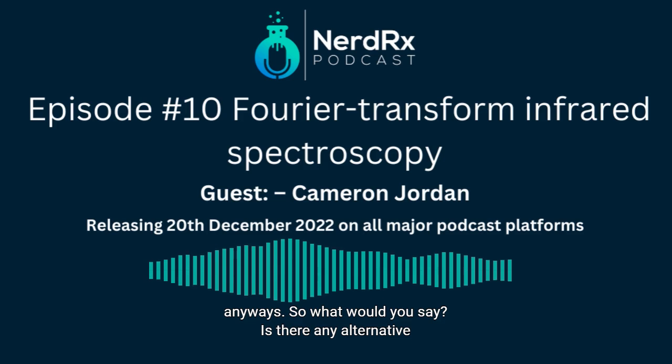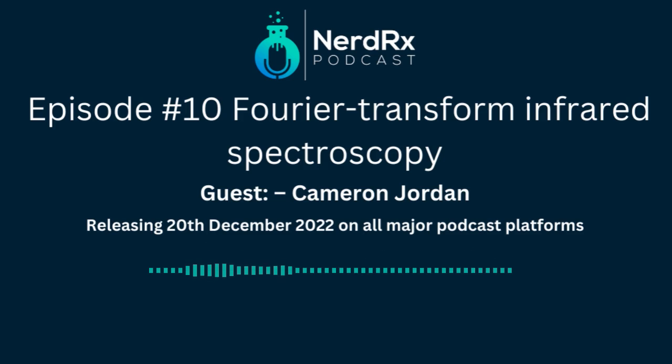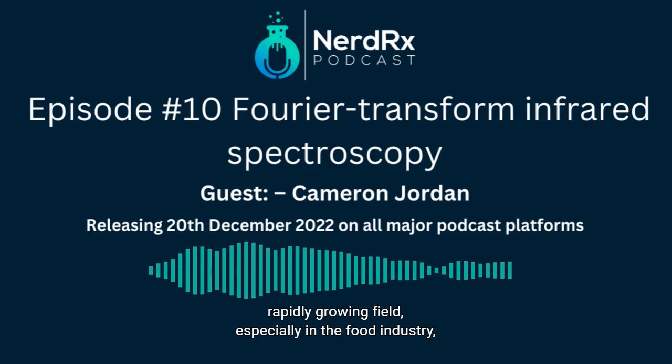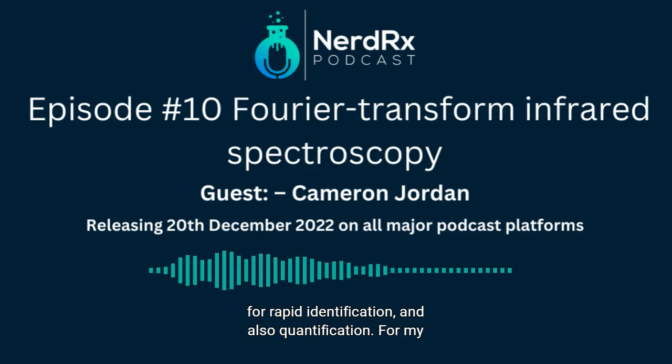So, what would you say? Are there any alternative techniques you can use other than FTIR? So there are actually a lot of alternative techniques to FTIR. Like you mentioned, NMR is a rapidly growing field, especially in the food industry, for rapid identification and also quantification.